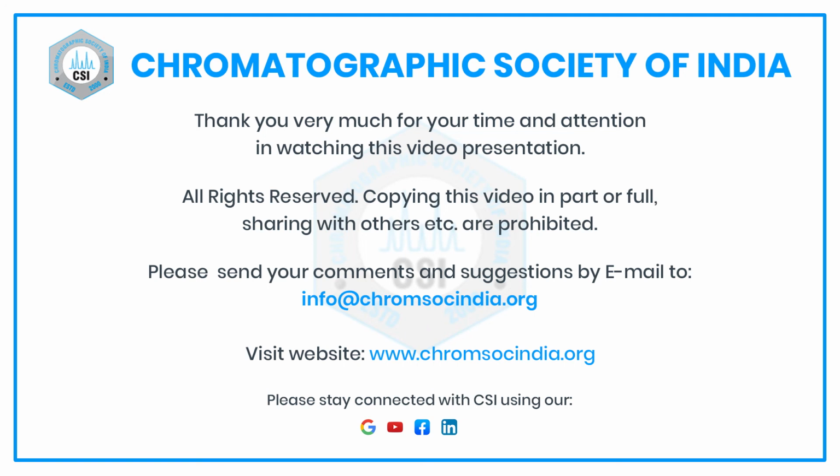When somebody brings a sample to you on LCMS, even if you have different LCMS systems in your lab, please look at the sample. That is where I say organic chemistry helps a little to your strength: look at the molecule and see what will be amenable. Even if you have everything available, first try the sample on ESI. If it works on ESI, nothing like that. If it does not work on ESI, then see whether it is necessary to do APCI. Then you do APCI. And if it doesn't work on APCI, go for APPI.